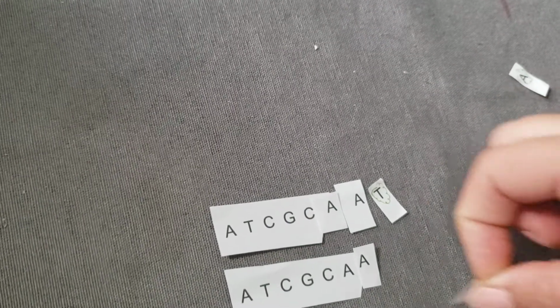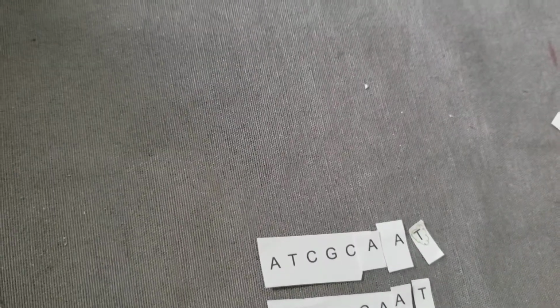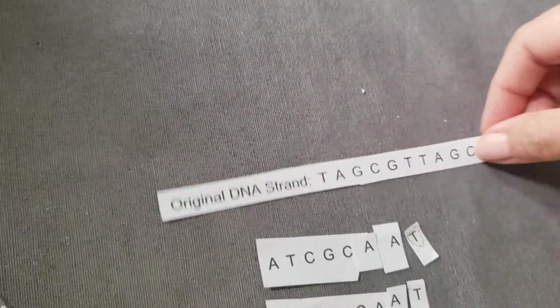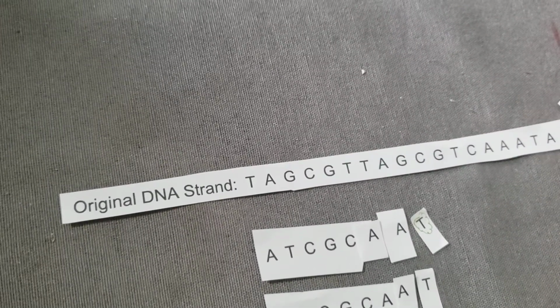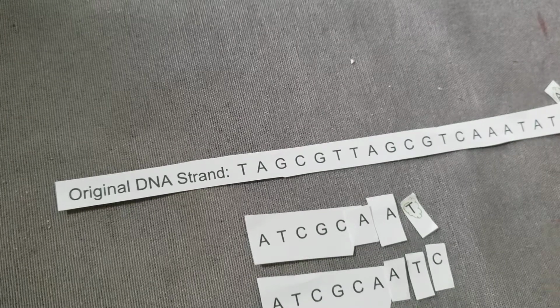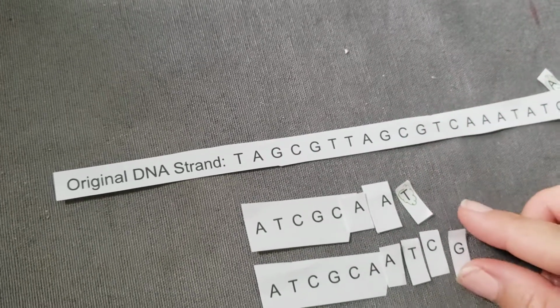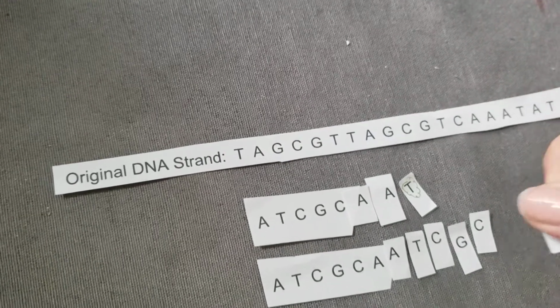And the T, which in this case isn't fluorescent. And then let me revisit what the order should have been. A, C, and then a G, and then it had a C, and then we went, whoops, fluorescent A.